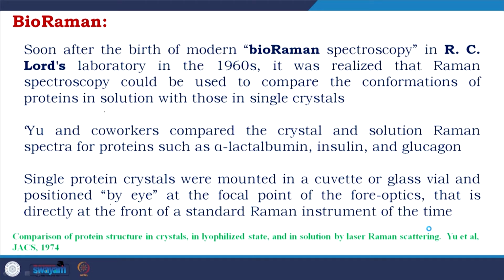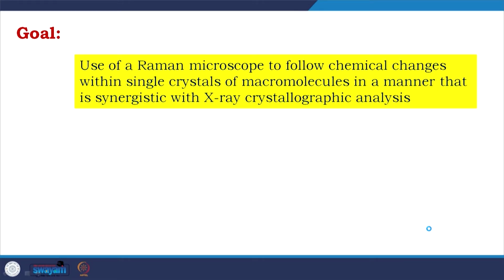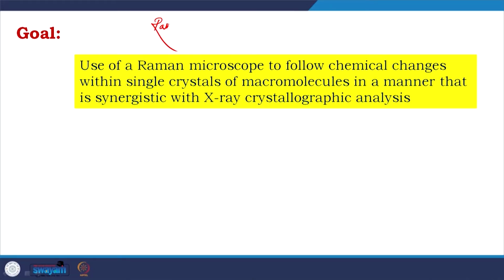Now I will talk about how the changed setup gives us more control. The goal is to use a Raman microscope to follow chemical changes within a single crystal of a macromolecule in a manner that is synergistic with X-ray crystallographic analysis. So, basically, we are using Raman spectra, especially the difference in Raman spectra.